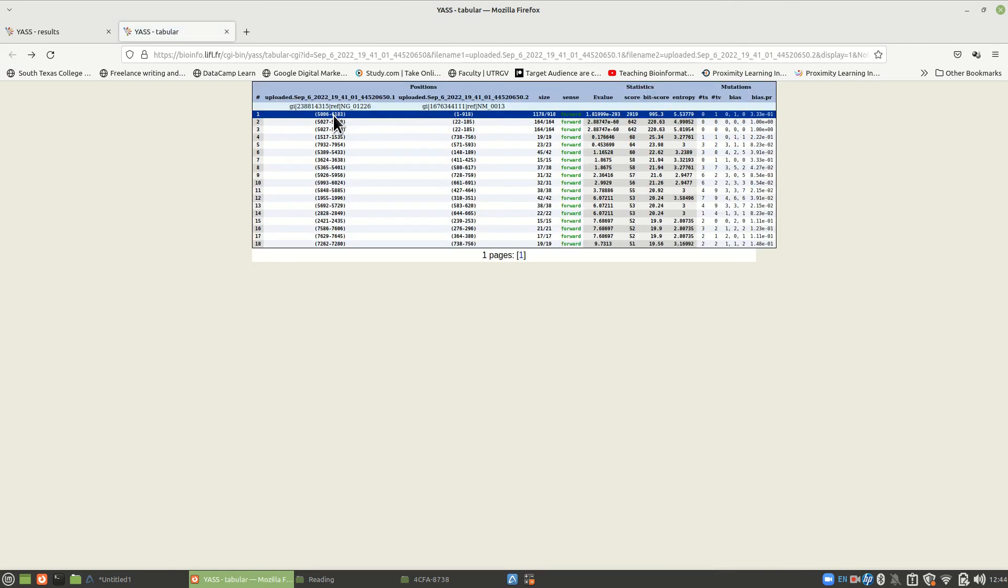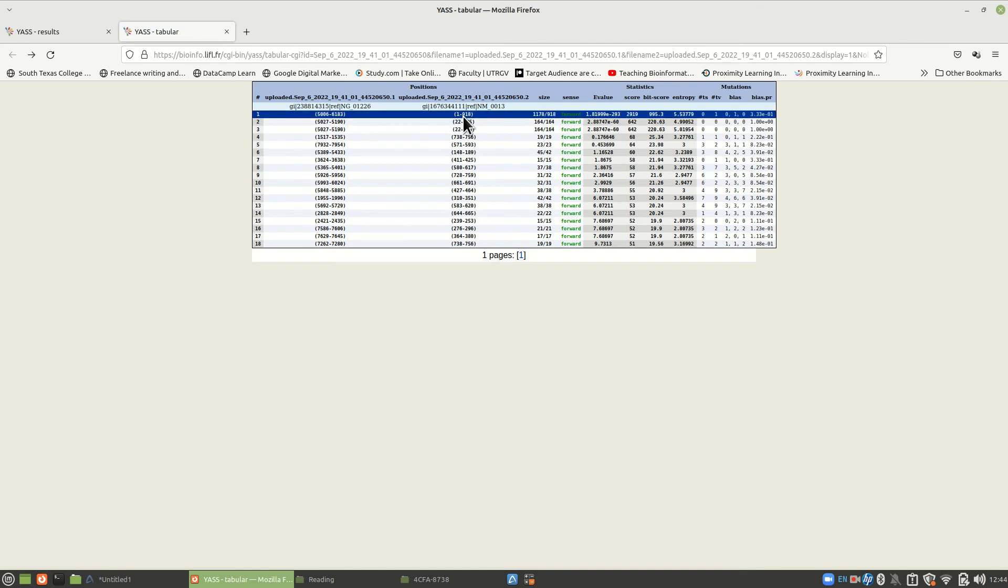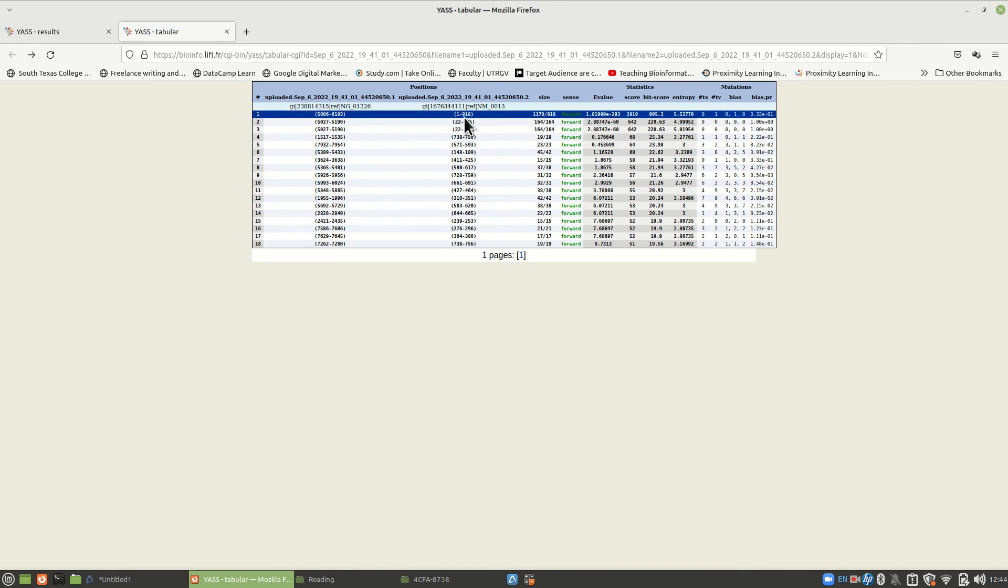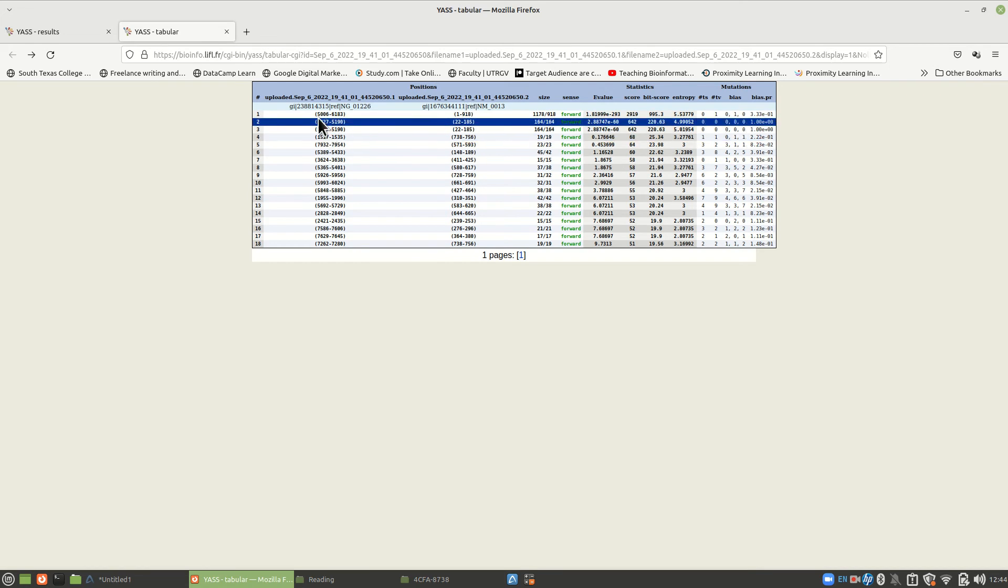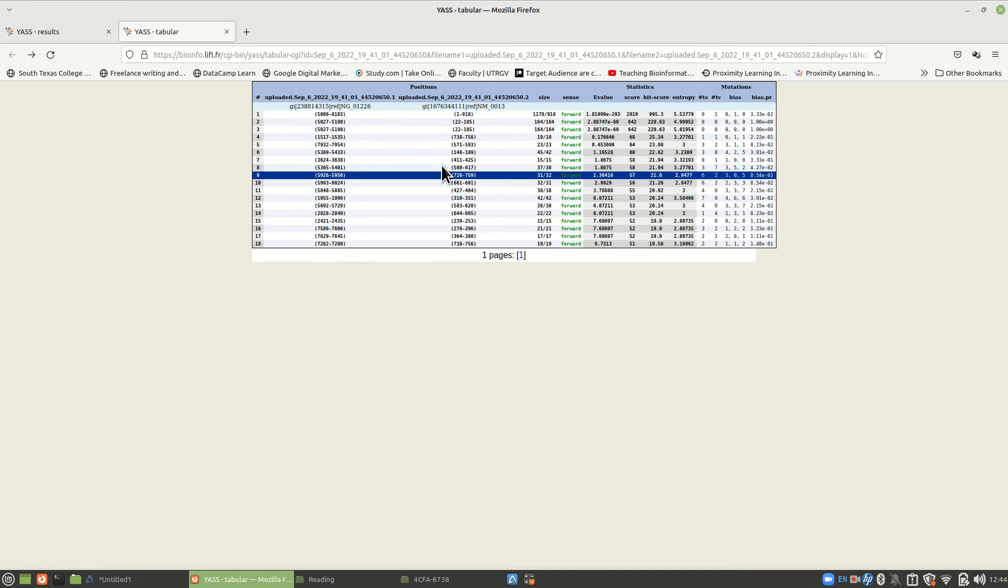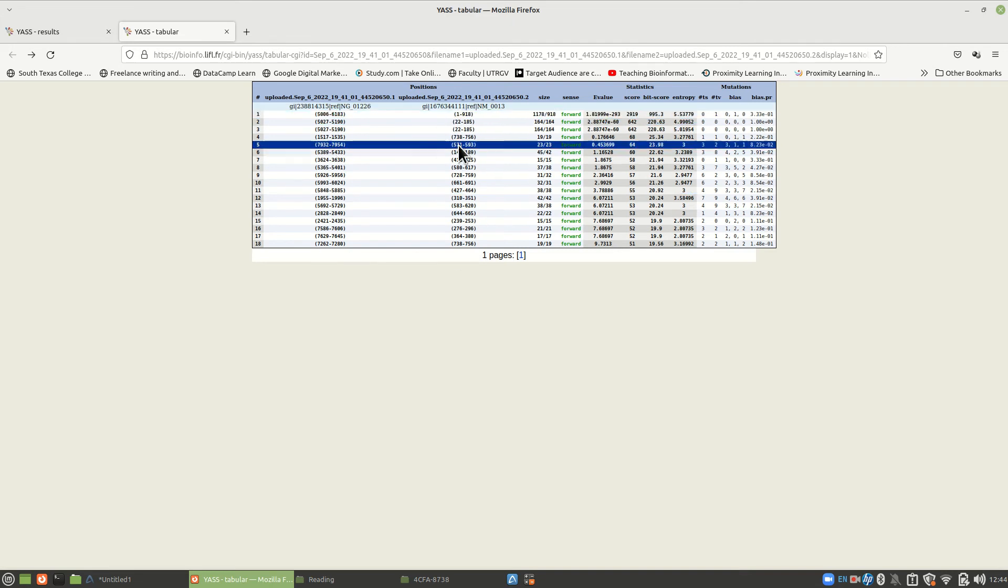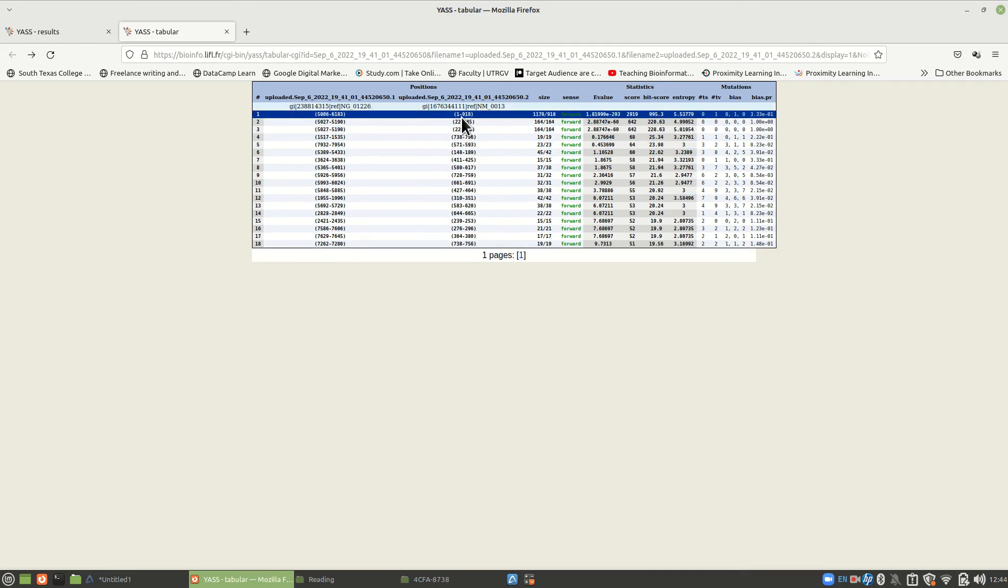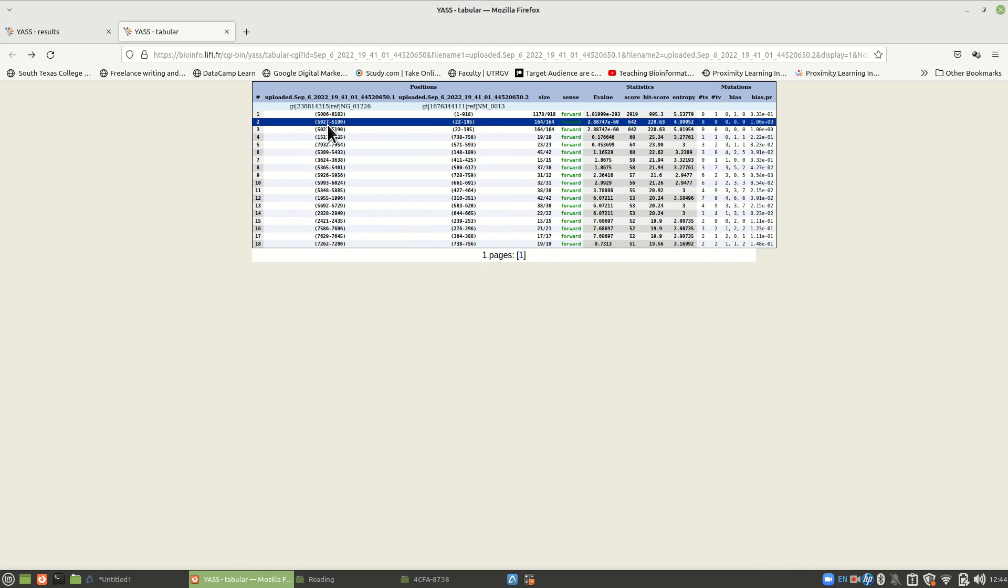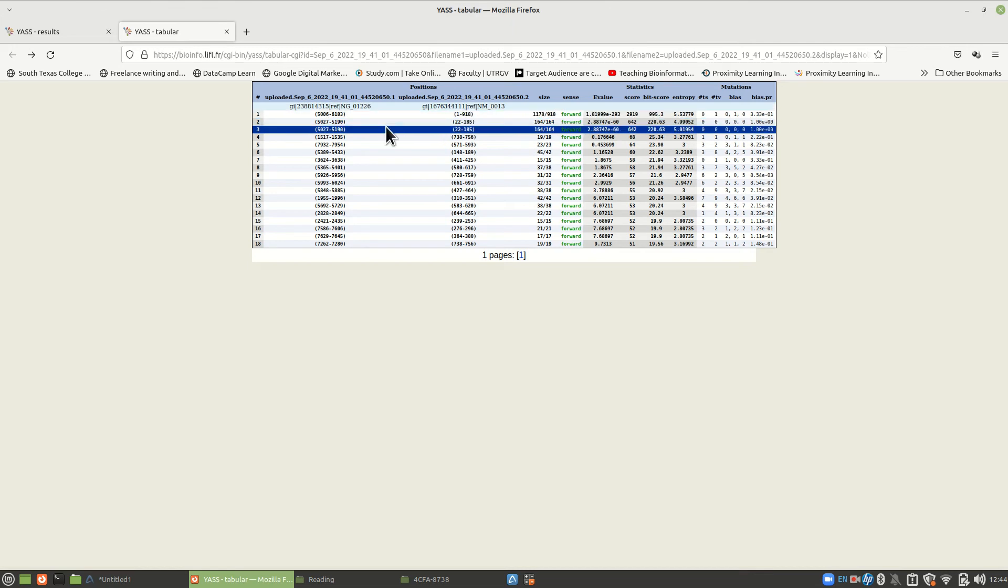But that's very good. But now you go down and there's another piece. This was from 1 to 918 on one of the sequences. But it's at 5006 to 6183 on the other one. So this is the long piece. And this is the shorter piece, the shorter FASTA.